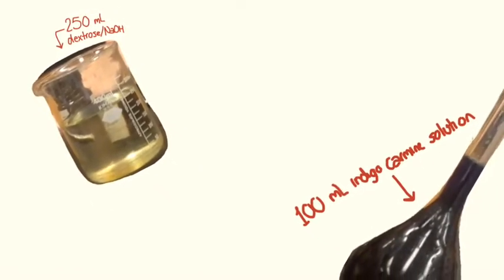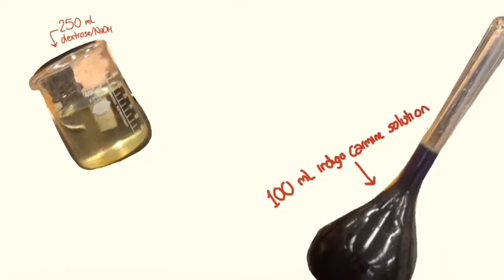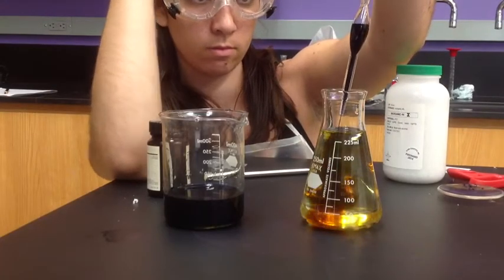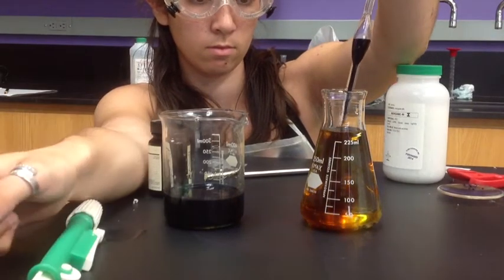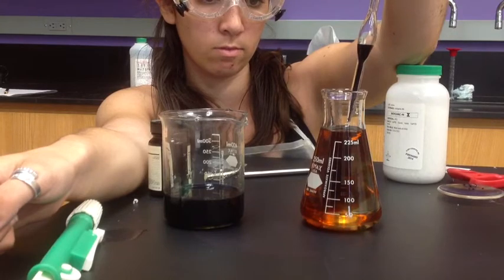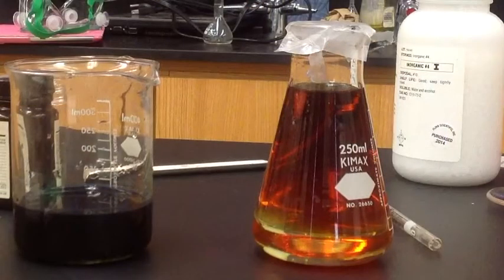Then add about 5 milliliters of the indigo carmine solution to the dextrose and sodium hydroxide solution. You'll see that the solution turns red. Once all of our materials are in solution, let's let it sit for 10 minutes while we explore the chemistry happening in the flask.